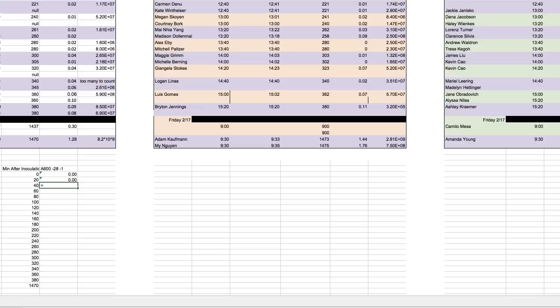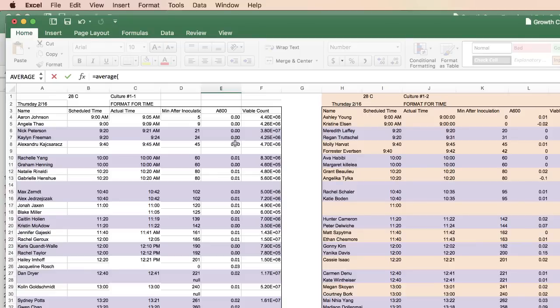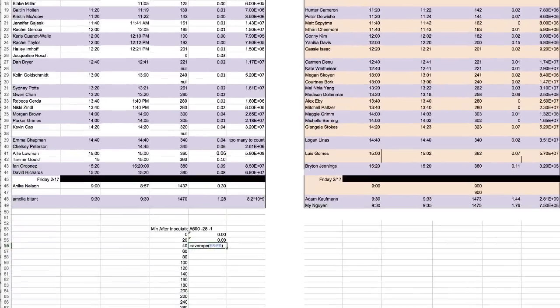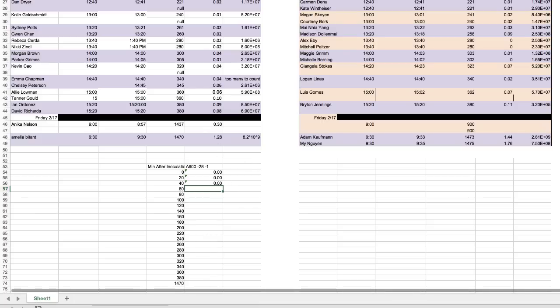For a time point where there's only one reading — like the 45-minute point where there's no second value — still select both cells and use equals average. Excel is smart enough that if no number is entered it just ignores it. Continue doing that through all your tables.